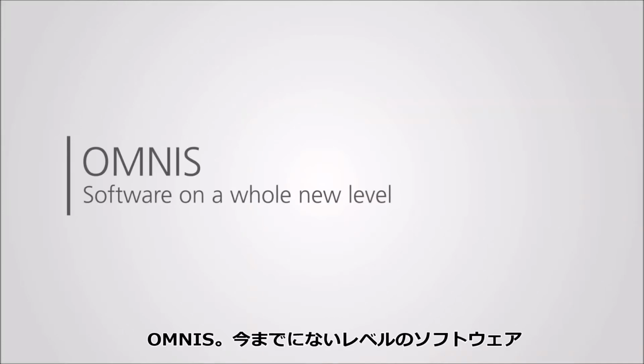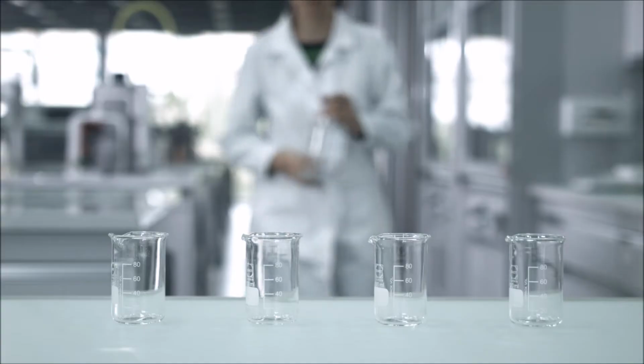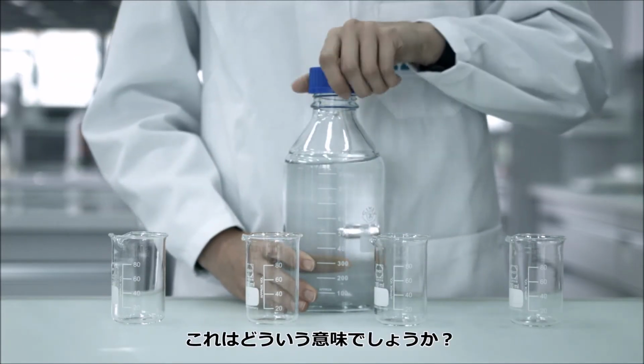OMNIS. Software on a whole new level. OMNIS puts the sample in the focus. Now, what does this mean?